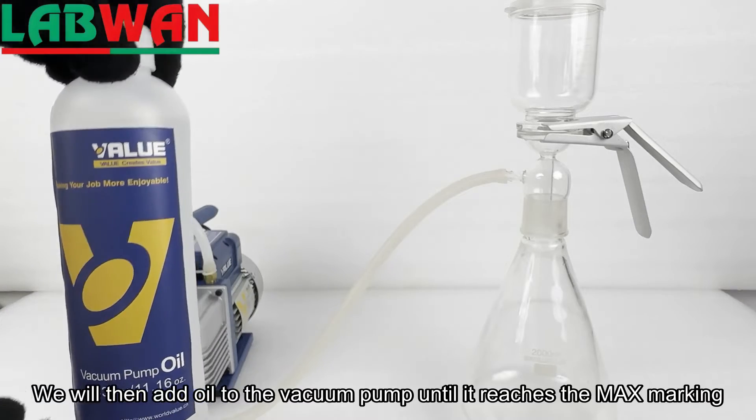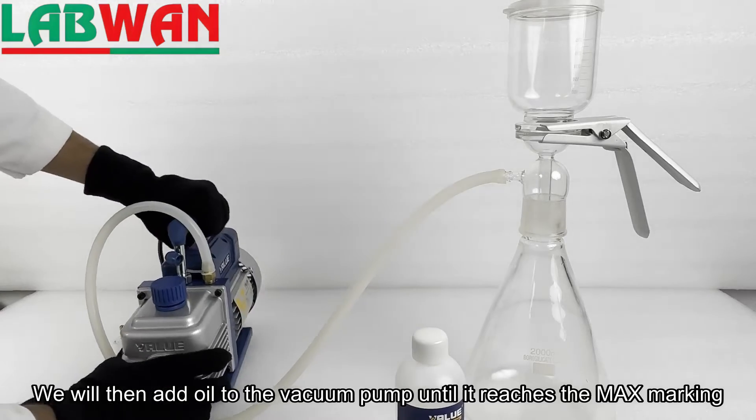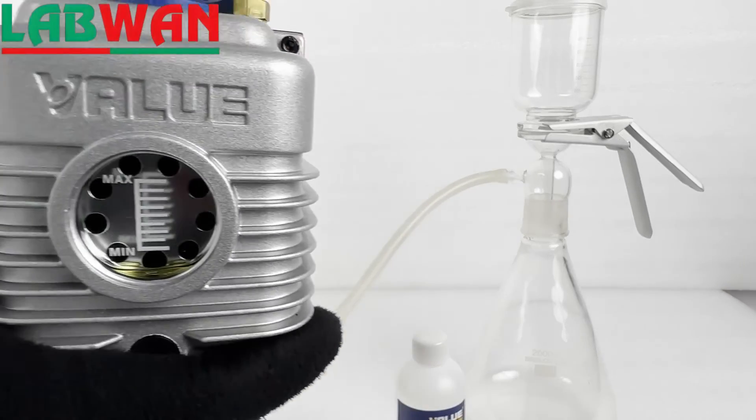We will then add oil to the vacuum pump until it reaches the max marking.